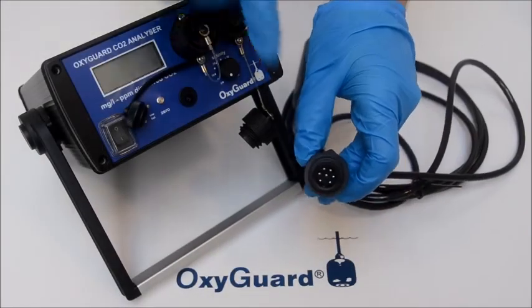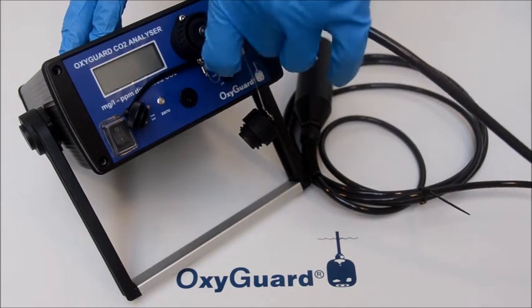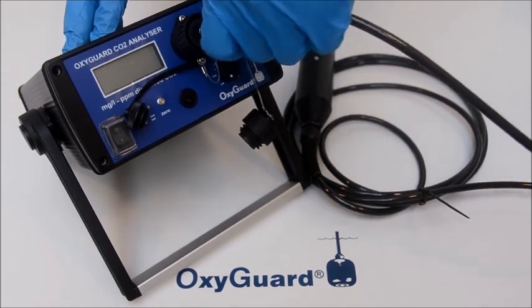Let's start with checking the instrument. Connect the probe to the CO2 analyzer and turn the meter on. It should show 0 or 1.